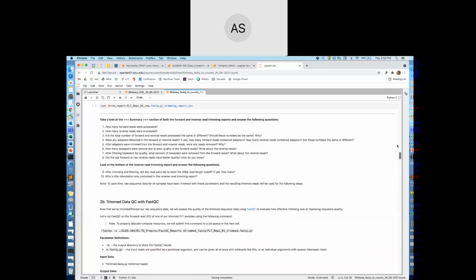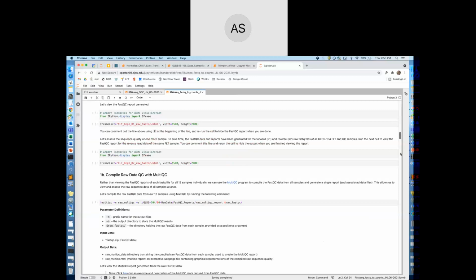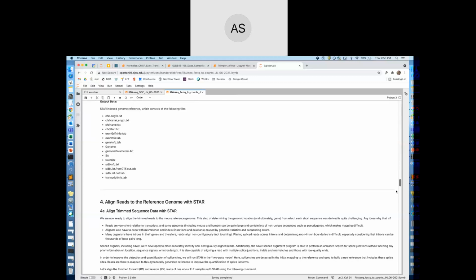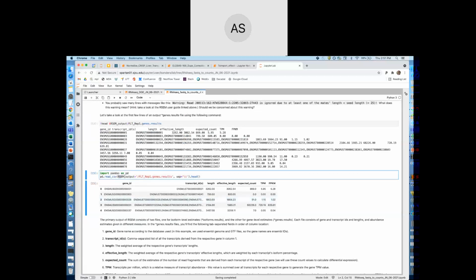So this is just a Python cell, and we've defined all these paths. These are all Python variables which we could also access in Unix because we define them in the kernel. So the Python syntax is to put the path here, use a plus sign, and then give the file name as a string.